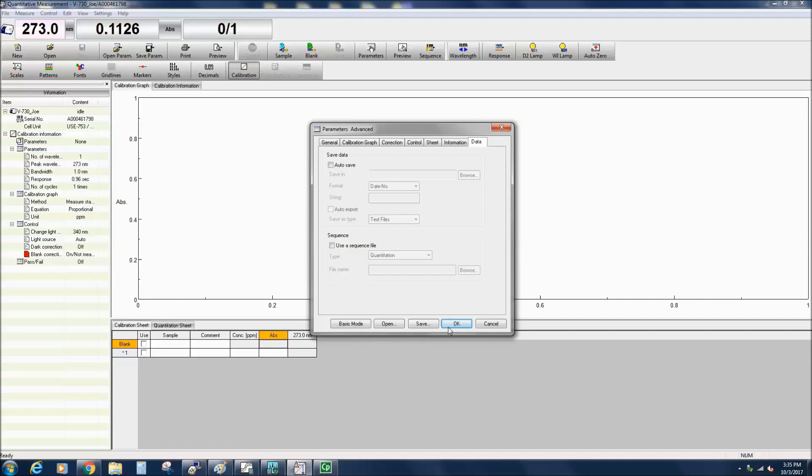You can also choose to save your measurement parameters, as well as open previously saved parameter files.